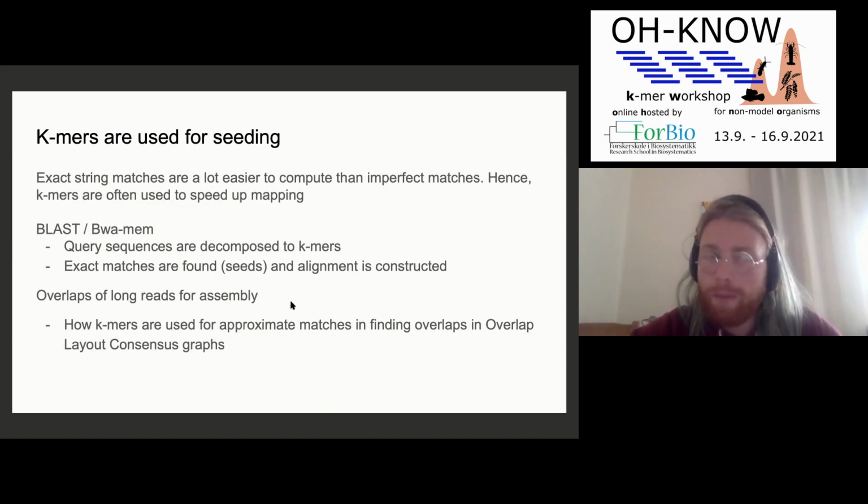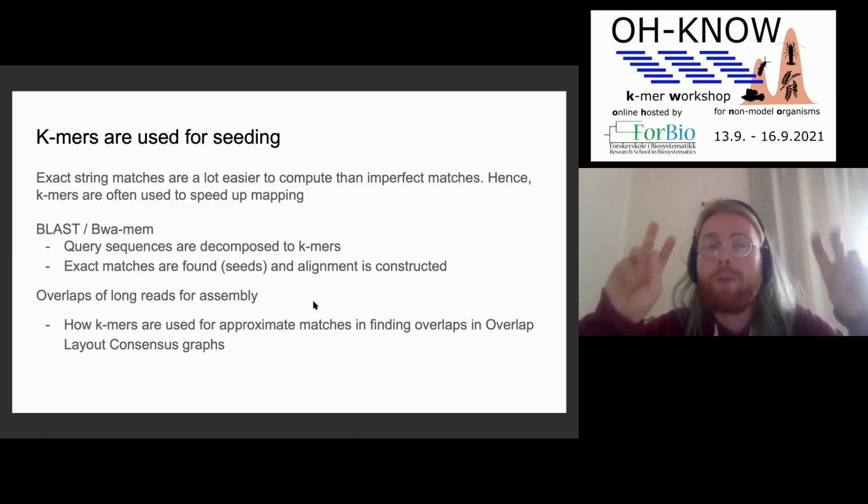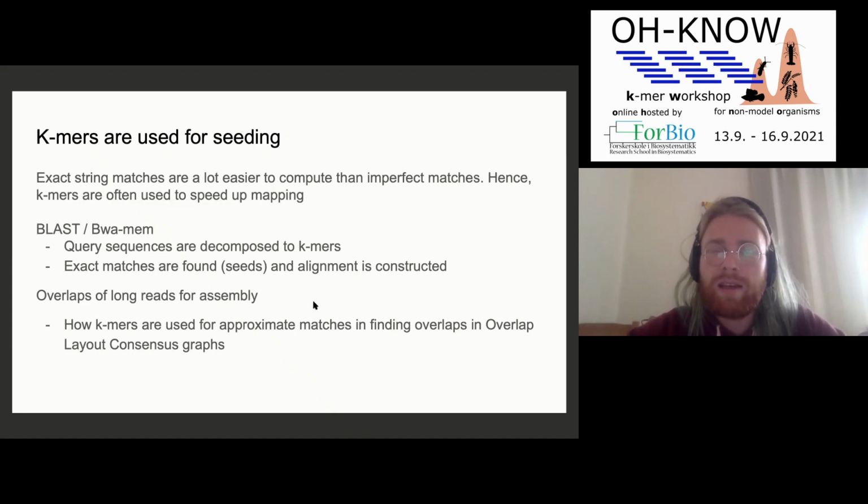This is even how BWA-MEM works, and we will actually exploit this property later on when we'll be doing perfect matching of Kmers to a genome. We will just tweak BWA-MEM by saying that we would like to have seeds of exactly the same length as the Kmers we would like to map. So this is, again, a case where the concept itself does not give us anything other than a computational speedup, but it's absolutely essential because sometimes when we're working with these enormous data sets, doing it the proper way is completely impossible.